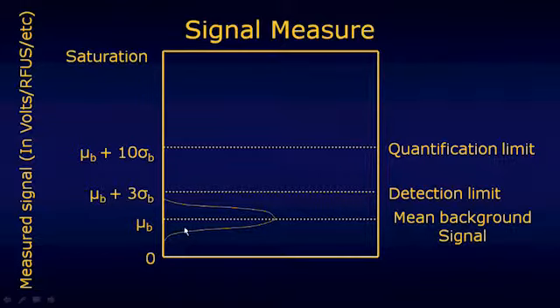From a statistical perspective, we can say this. If you find something that rises above that level, the average level of noise plus 3 standard deviations, it's very unusual noise, or it's something else, right? 99.7% of noise, on average, a typical bit of noise would fall beneath that line, okay? By the time you're up to 10 standard deviations above the mean, now we can be so sure that what you're looking at is signal as opposed to noise. That's extremely unusual noise to get that loud.